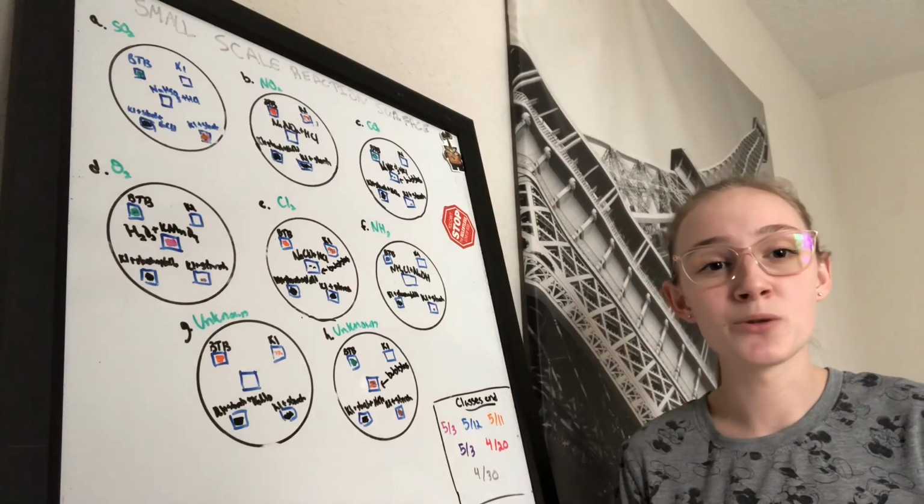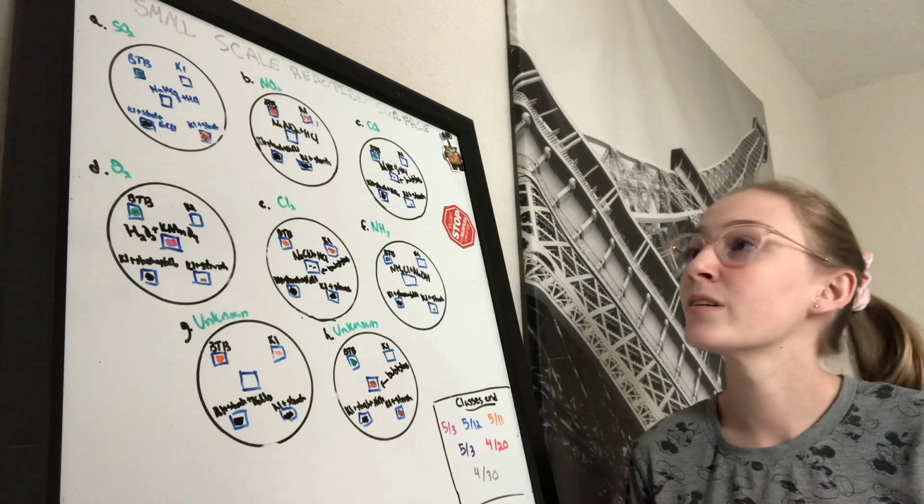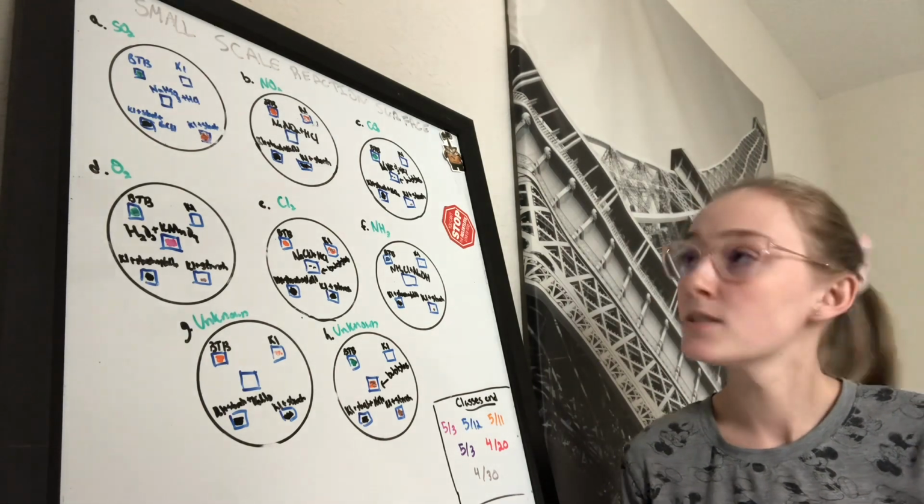Hello, my name is Barrett Rosarosso, and today I will be explaining how to do the experiment for experiment number 10, which is the qualitative analysis.